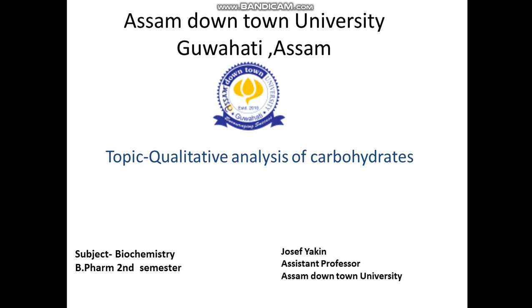So today's experiment is qualitative analysis of carbohydrate, where we are going to determine the unknown sample of carbohydrate. I have already explained the principle involved in the Molisch test and Benedict test, and those two tests we are going to perform. So in this video I will explain the procedures involved in the Molisch test and Benedict test to determine the unknown sample of carbohydrate.